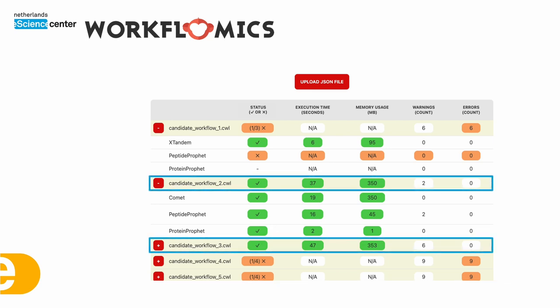At this point we have seen both the design time and runtime benchmarks and it is safe to assume that the candidate workflows two and three are the best suited to process our data considering that they both succeed in execution on the benchmark data and the resource consumption is not that high. And the user could now download either one or both CWL files and use them to process their data locally.